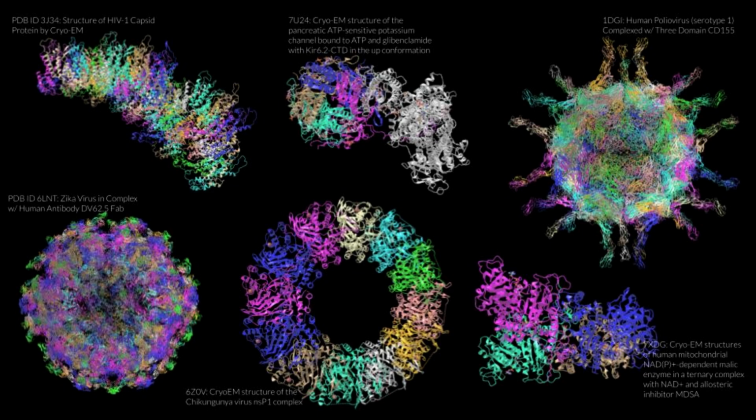It can also tie into studies involving transfection and luciferase reporter assays by visualizing these structures of macromolecules involved in gene expression. The detailed insights it provides aid in studying protein-protein interactions by visualizing the 3D structures of interacting proteins, providing valuable insight into the cellular signaling pathways. Cryo-EM is truly a catalyst for breakthroughs that enable us to uncover the mysteries that underlie the fundamental processes of life. Its impact extends far beyond the scientific community, influencing our approach to biomedical research and opening new avenues for exploration in the future.